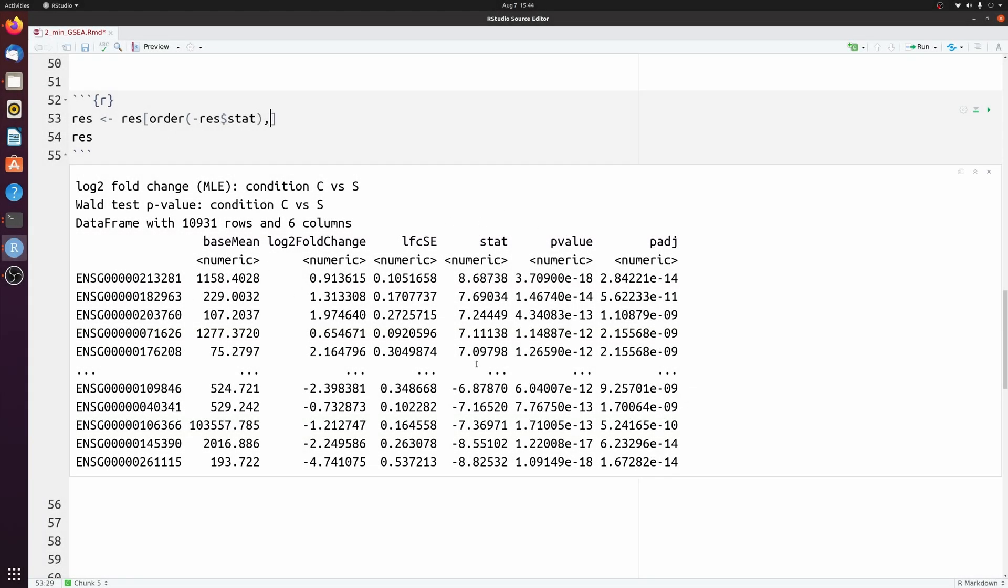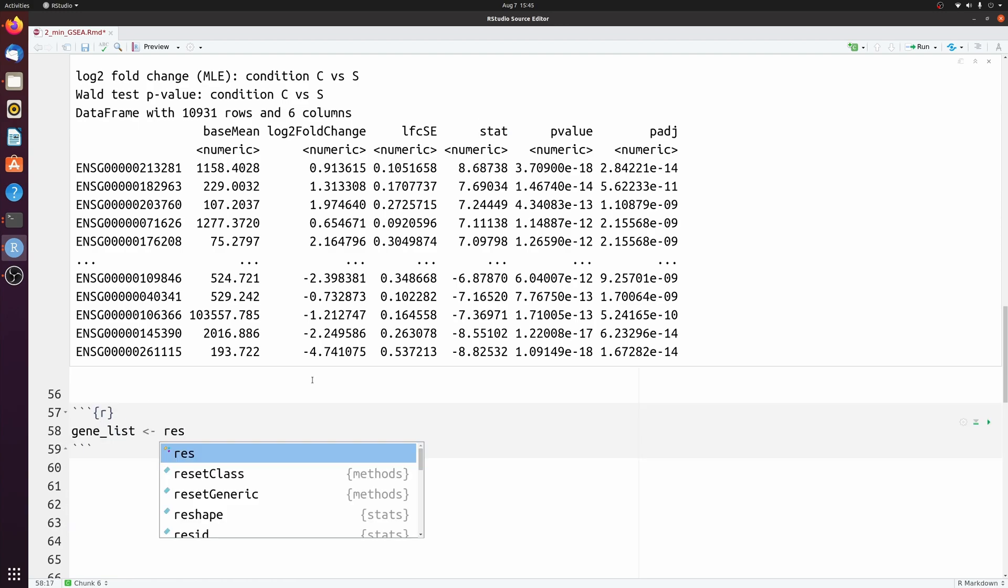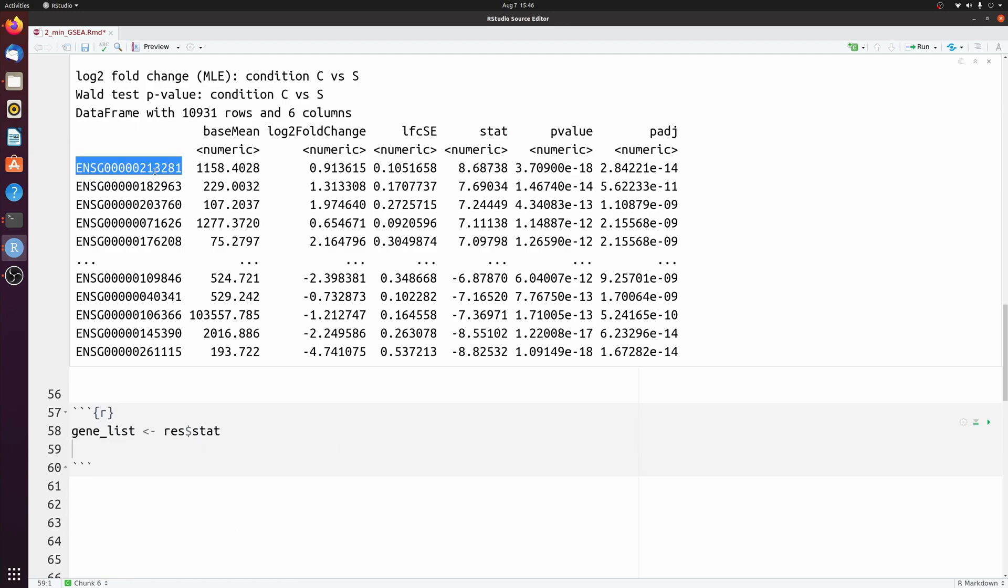Alright, so now that we have this ordered, we're just going to extract the stat column. And then we're going to add the row names from this data frame to the names of this gene list.